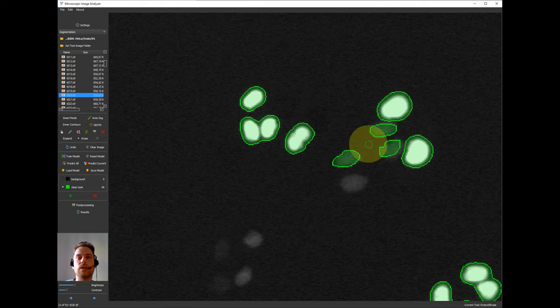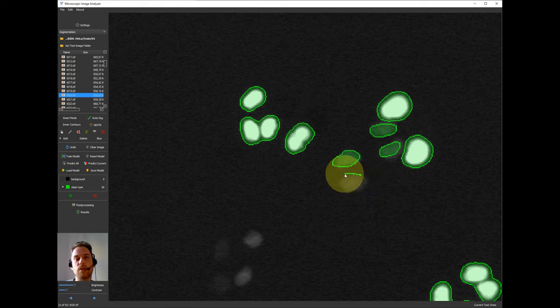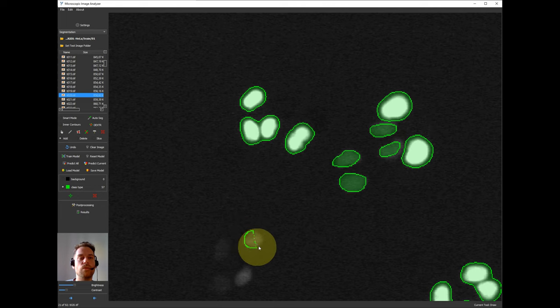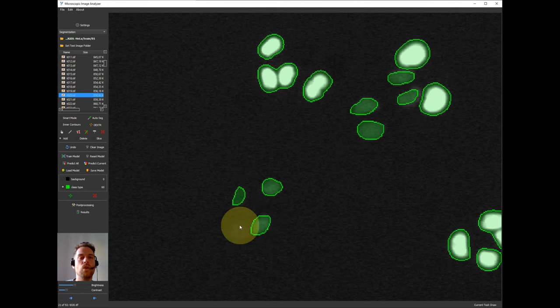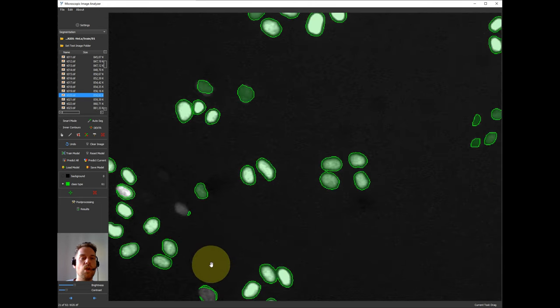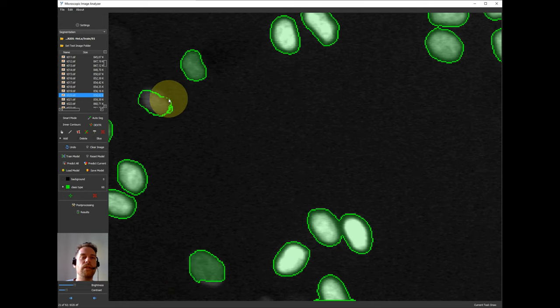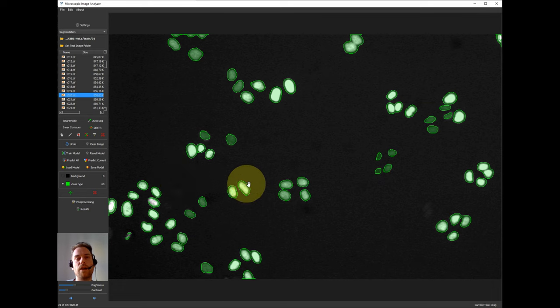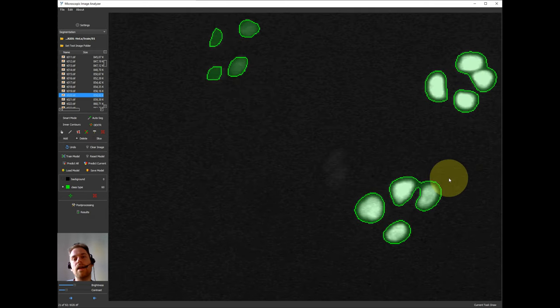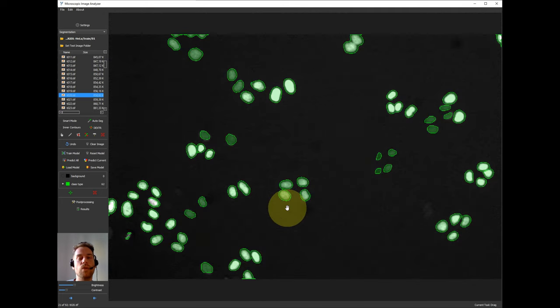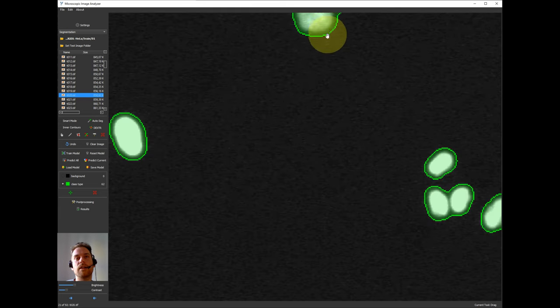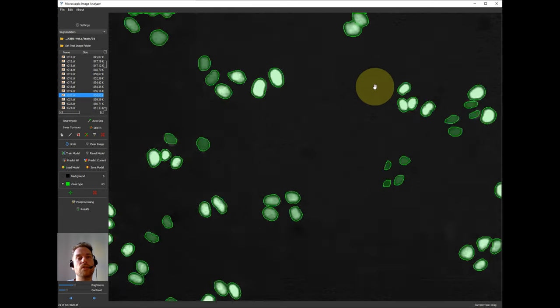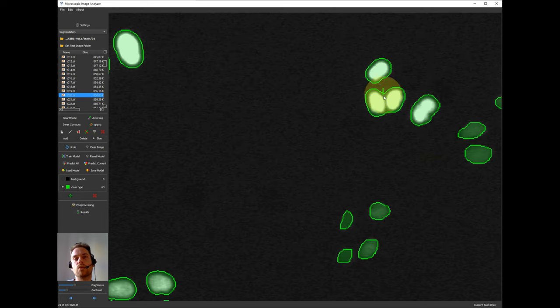Once we have trained a model then we will try to predict the rest of the training set and use these predicted labels to correct the labels if they are not perfectly predicted. And use this extended data set to get an even better model.